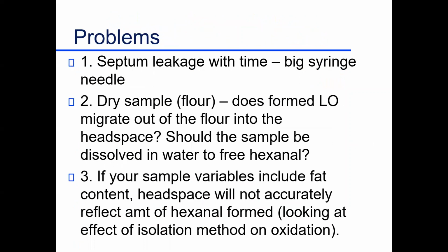And it really is. But again, any methodology used, I don't care what it is, you need to know what you're doing. You need to know what the pitfalls are in that methodology. Because you can be doing things that seem really right and find you miss the point. In this methodology, putting things into a bottle, closing them up, coming to equilibrium, well, septum leakage can be a problem. If you've sampled that vial more than once, sampled a couple of times, well, there may be a leak.